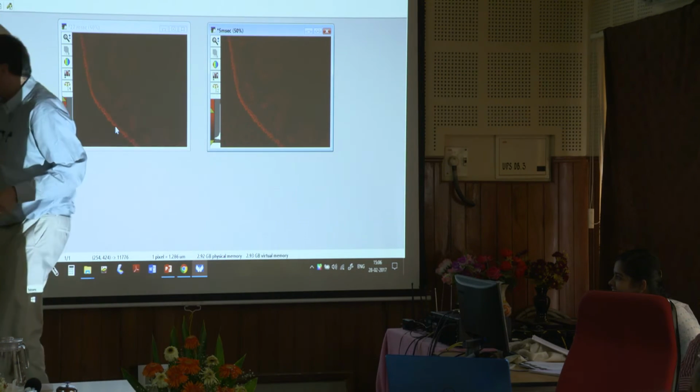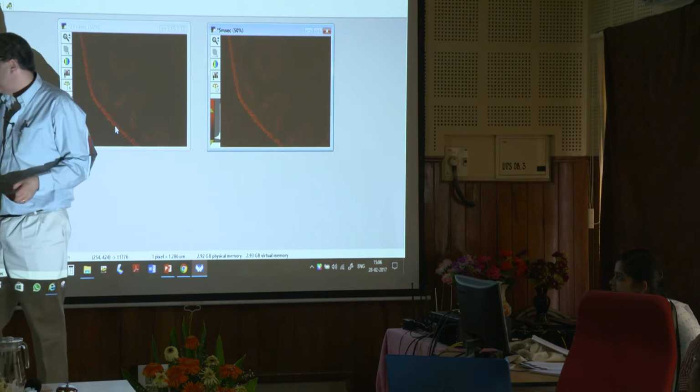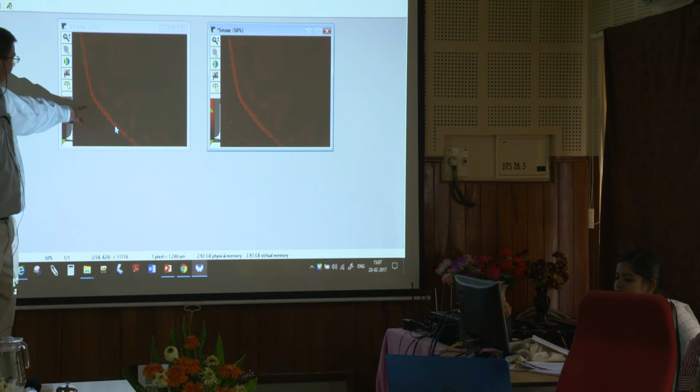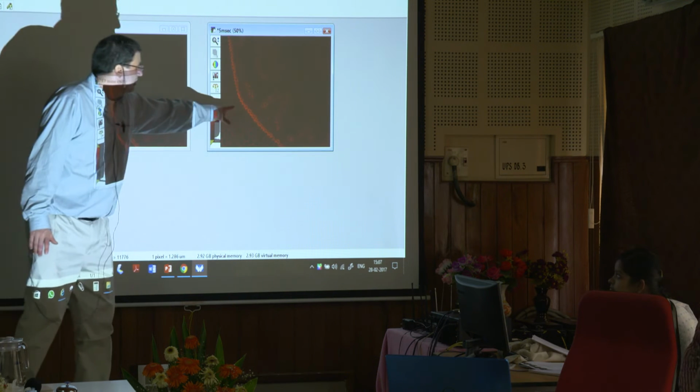I am using more of this. Remember what I said. If I can use more of this, then when I go down to do image analysis and such, everything is better. Life is easier. Life is better. These two pictures look exactly the same. They are not even close to the same. This is a very good image. This is horrible. Okay.